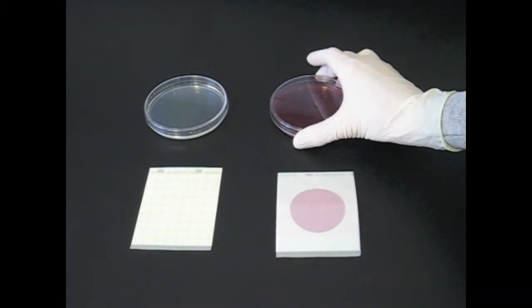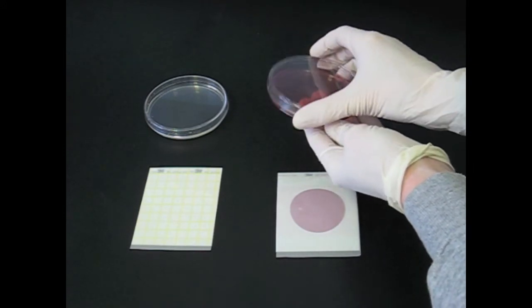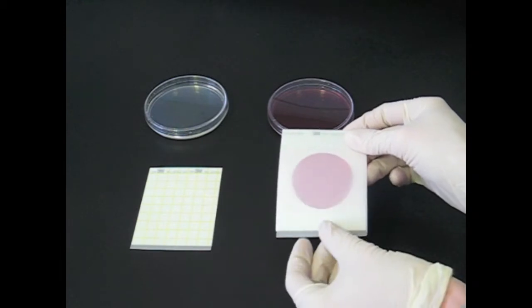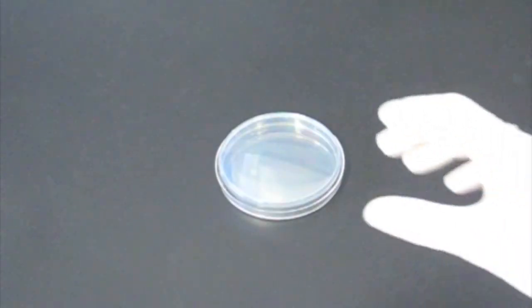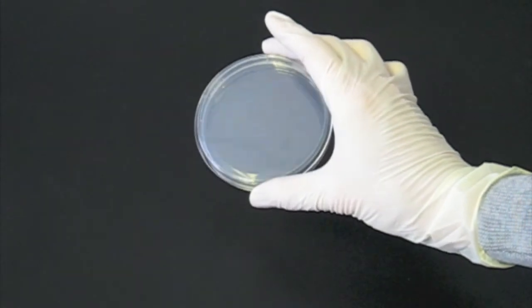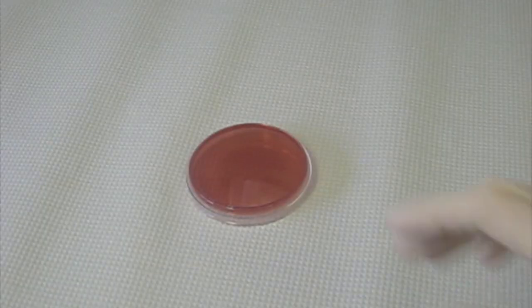Bacterial culturing in the lab begins with selecting a food or medium for the bacteria to grow on. The media is stored in either a petri dish or plate, or in a petri film. For the standard plate count, a media that will grow almost any kind of aerobic bacteria found in milk is selected, typically a media called plate count agar. Plate count agar is also used for the preliminary incubation and laboratory pasteurization counts.